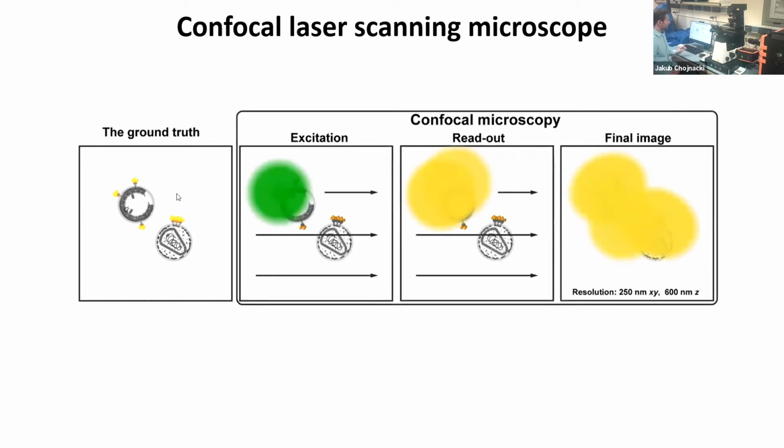So with laser scanning microscopy, when we ask it to look at the sample, it scans a laser beam of light in a line pattern, and then reads it out. Think of it a little like an old TV, where the electron beam used to scan across the monitor and generated the image.